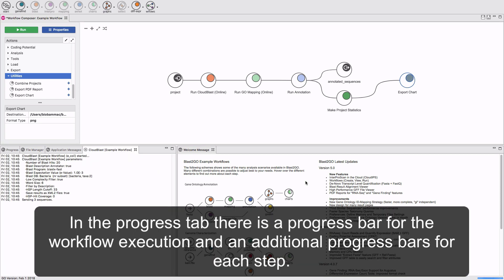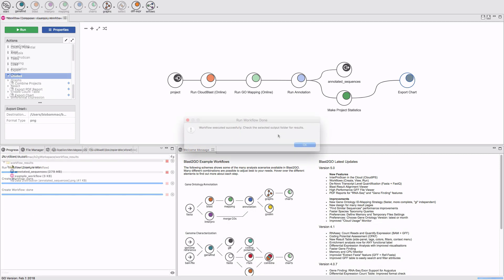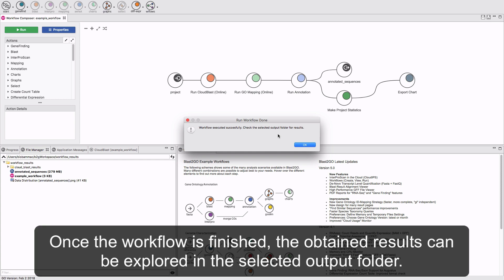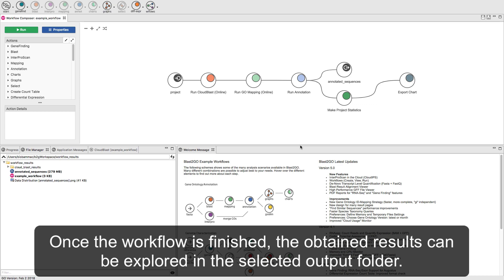In the Progress tab, there is a progress bar for the workflow execution and an additional progress bar for each step. Once the workflow is finished, the obtained results can be explored in the selected output folder.